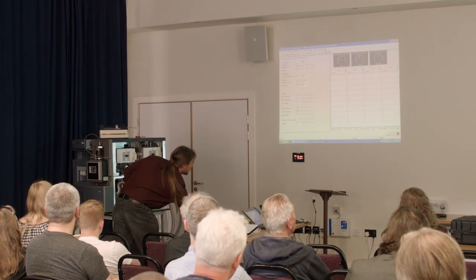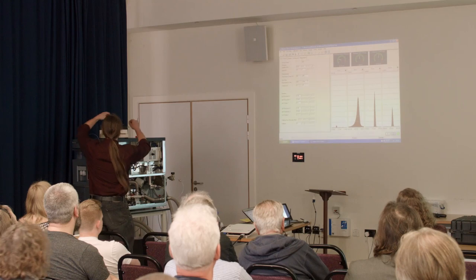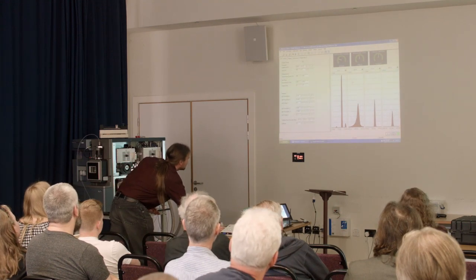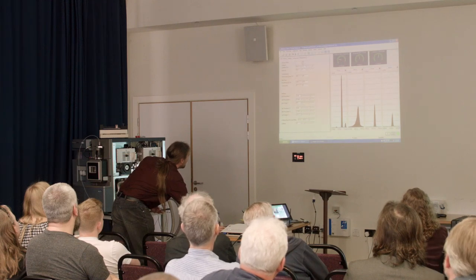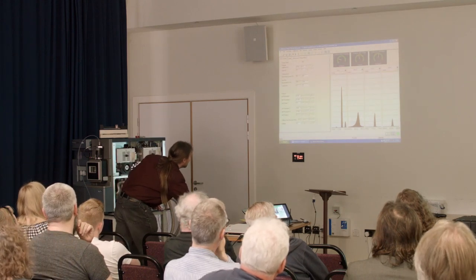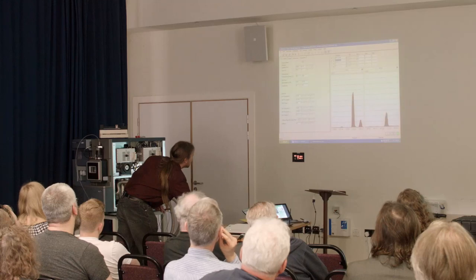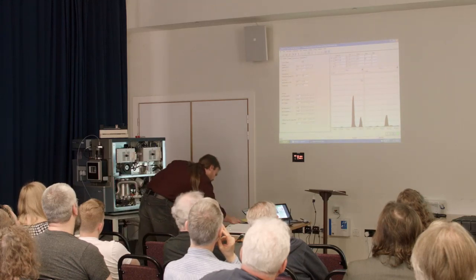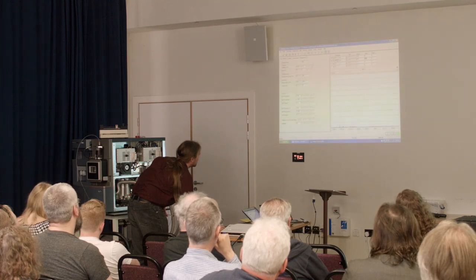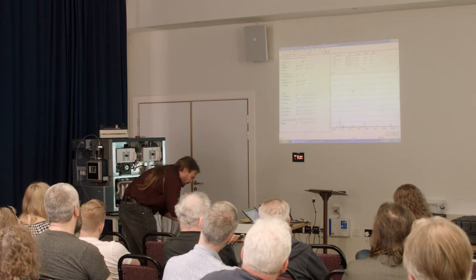I'll just switch it on. At the moment, what I've got going through this is just some solution. These are the masses at the bottom. This is the vacuum here. The top here is for the electrospray capillary. Hang on a minute, let me just get rid of this. So here, this is our mass spectrum. Actually, let's just go straight for the paracetamol.